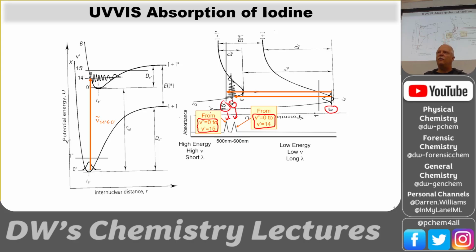So that's your job first, is to go through the spectrum and identify and peak pick and assign the lower state V value and the upper state V. And once you get up the tables of all of those, then you'll be able to do a regression and pull out all of the physical constants.